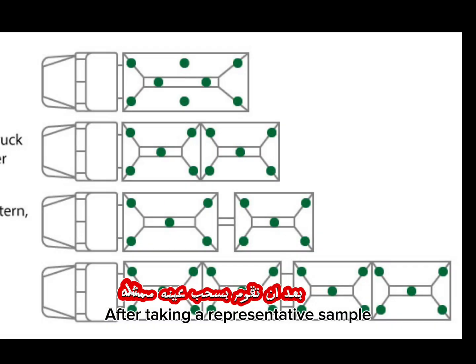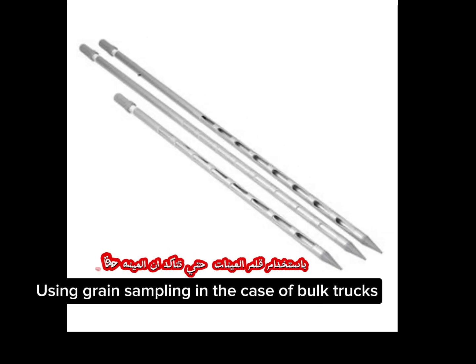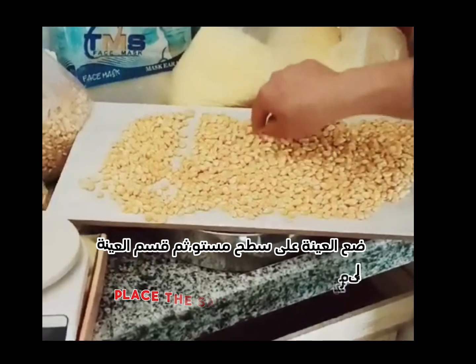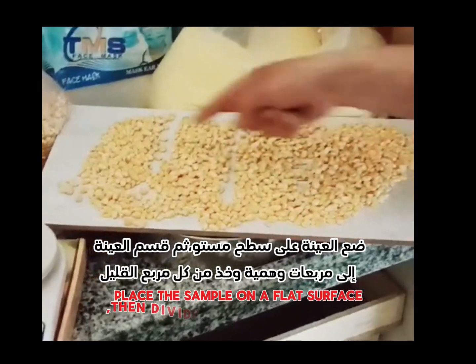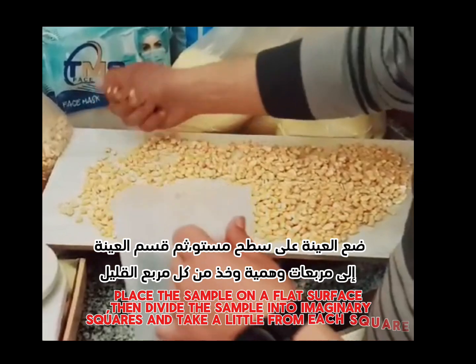After taking a representative sample, use grain sampling in the case of bulk trucks. Place the sample on a flat surface, then divide the sample into imaginary squares and take a little from each square.